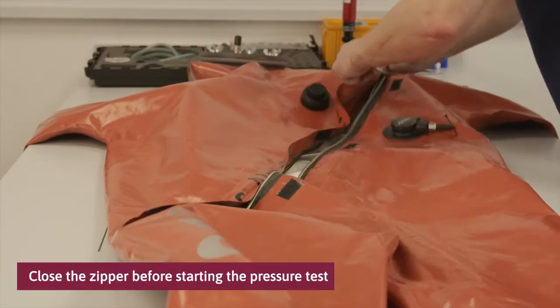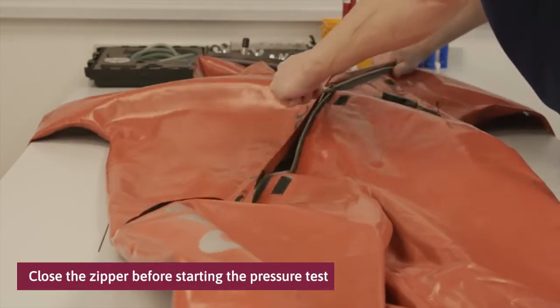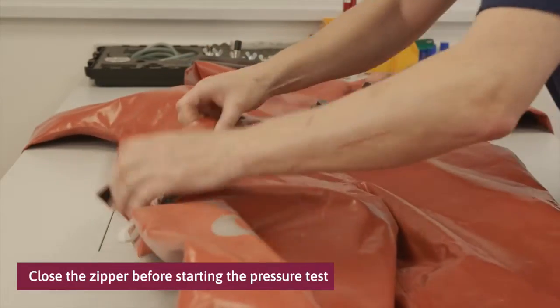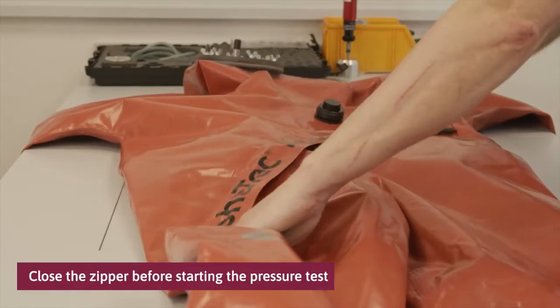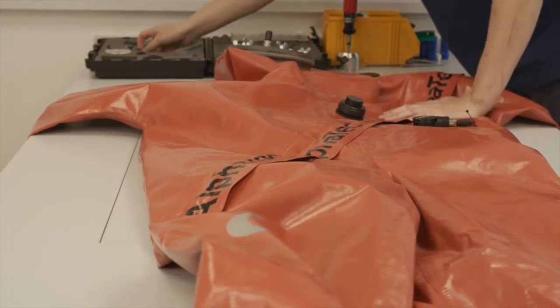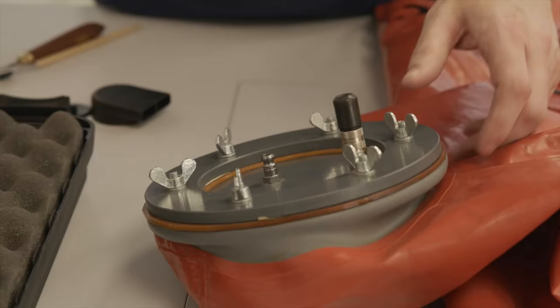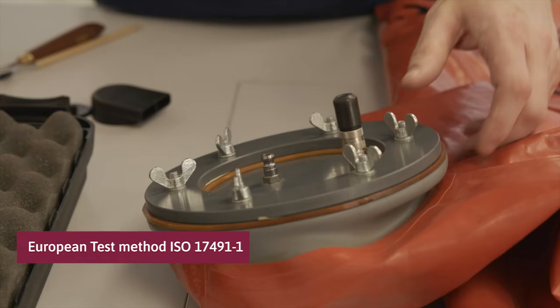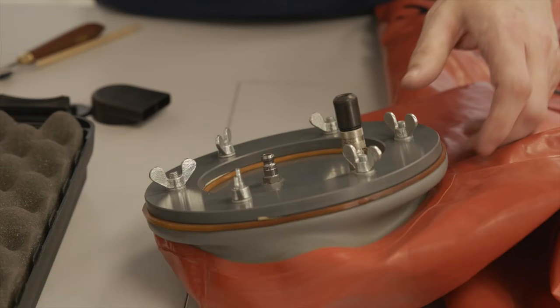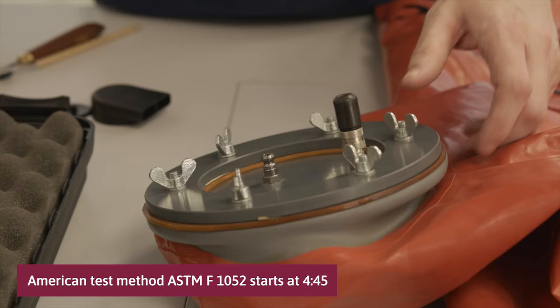Close the zipper before starting the pressure test. There are two different methods for pressure testing a gas tight suit: the European test method ISO 17491 part 1, and the American test method ASTM F1052. Follow the American test procedure at 4:45.